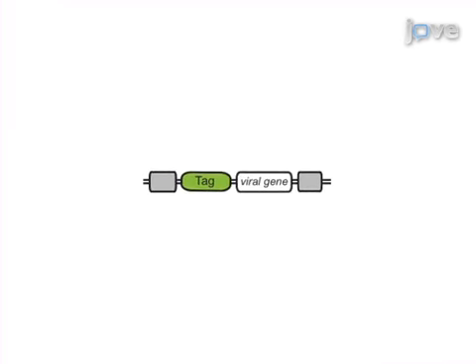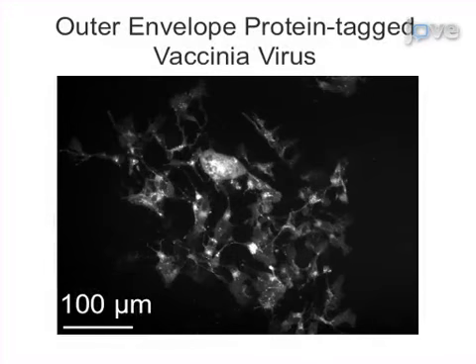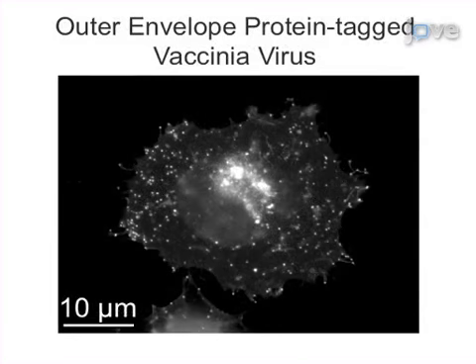Next, remove the metabolic selection to excise the marker cassette and isolate the cells containing recombinant viruses by fluorescent marker selection. Results of viral plaques on cell monolayers allow visualization of individual virus particles that are characteristic of the fluorescently tagged gene.